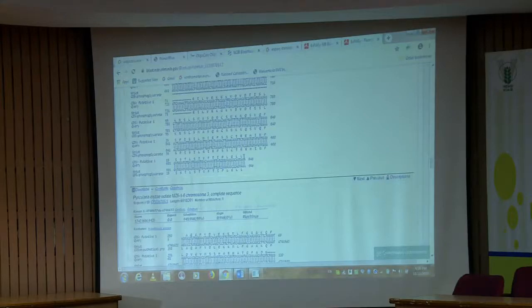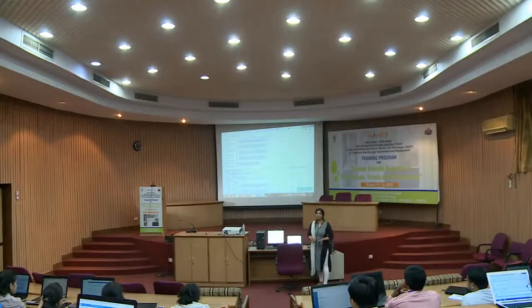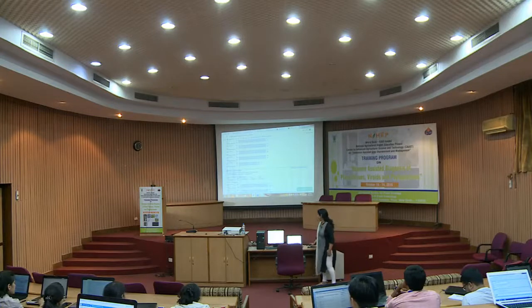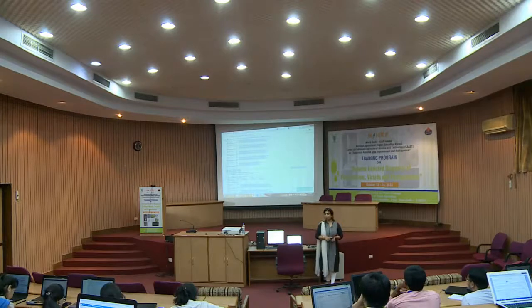You just try this after going back from here, otherwise you will forget each and everything, that I know. It happens with anyone. So once it is done, and that flat file is ready for submission, then there is one option, that is Sequin, Sequin macro send.